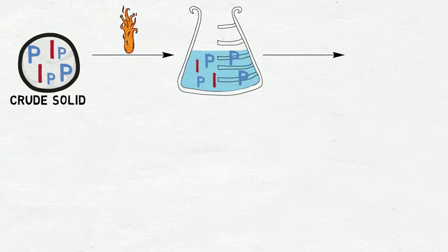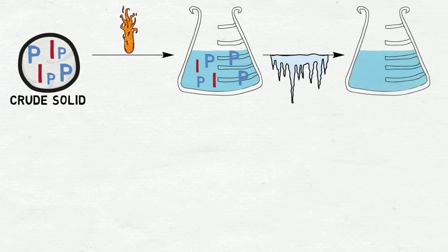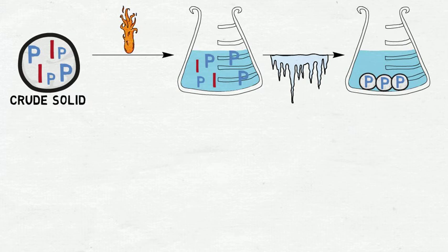Once the solid is dissolved, we let the flask cool down. If the solvent has been chosen correctly based on the impurities and the desired product, the product will precipitate as pure crystals since it has a lower solubility at lower temperatures, giving us an opportunity to separate it while the impurities remain dissolved in the solvent.